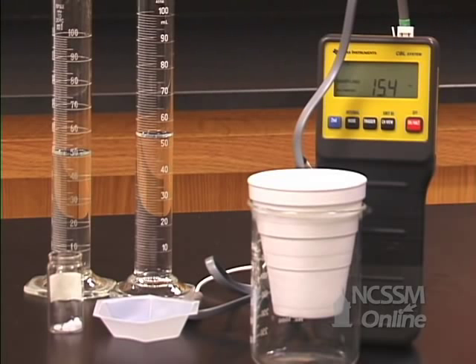In part three of our Hess's Law experiment, we will measure the heat of neutralization of an aqueous solution of hydrochloric acid and solid sodium hydroxide.